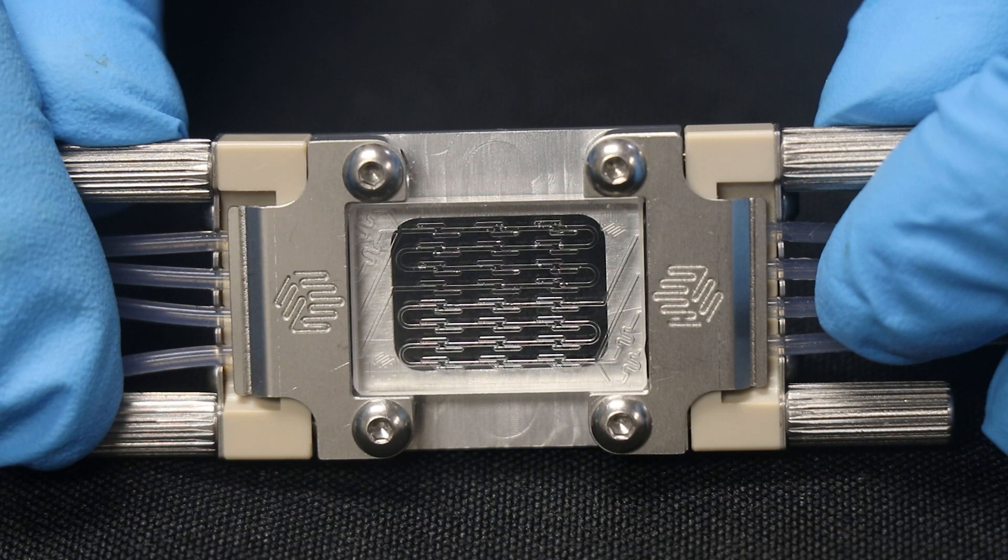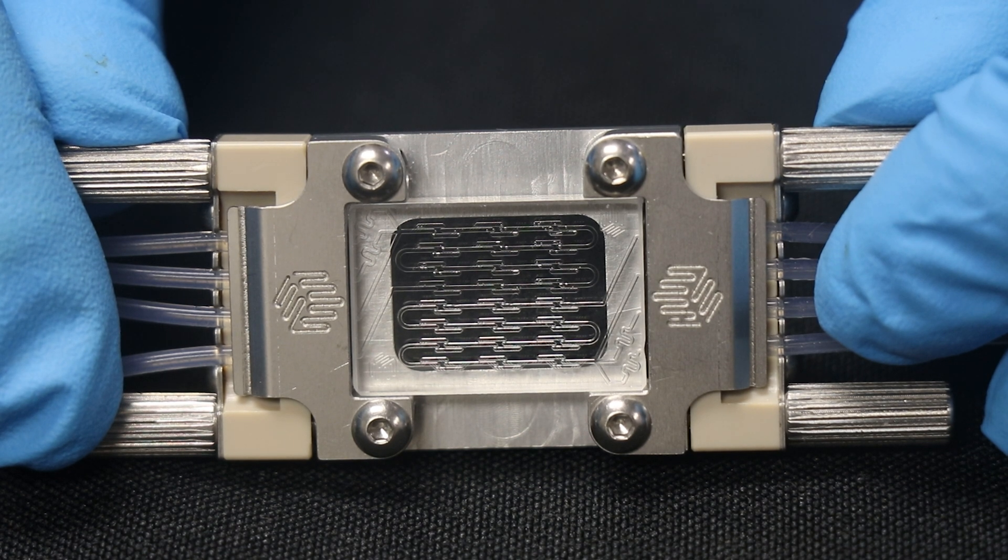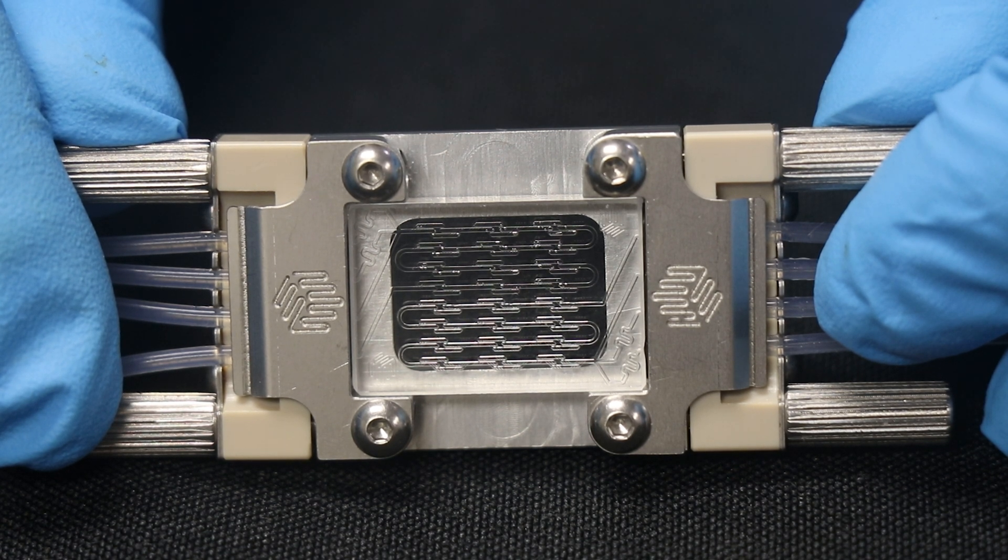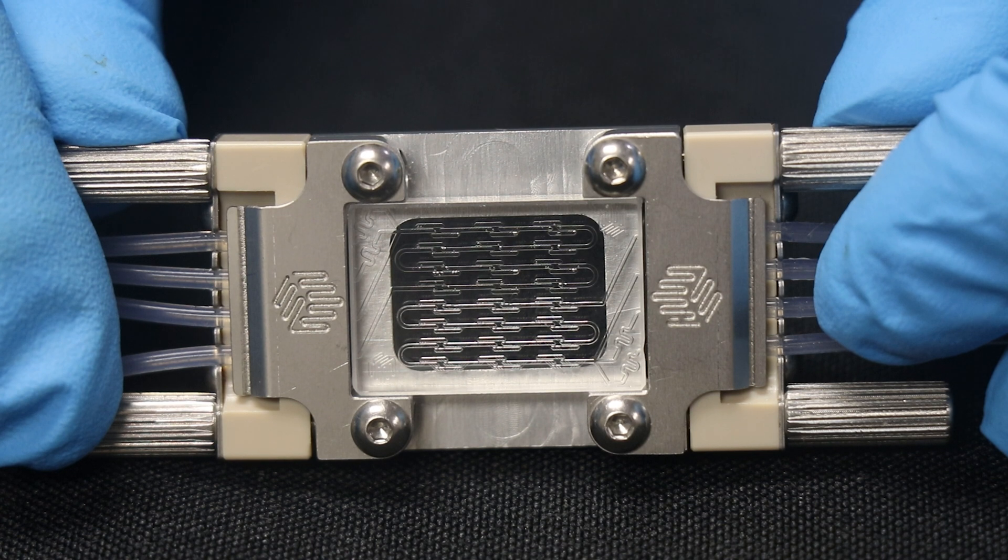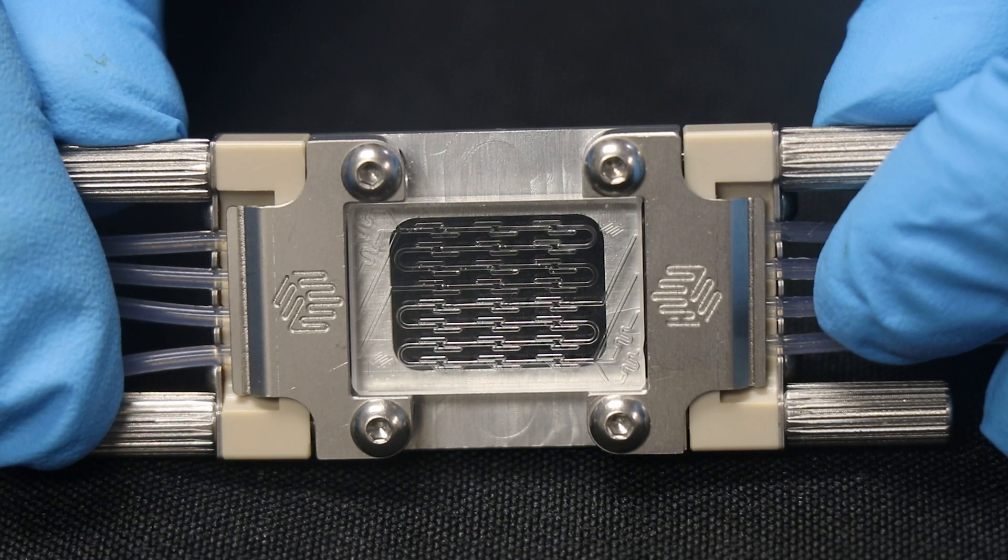Different chip architectures should be evaluated as a process parameter, especially if you are targeting different particle morphologies. Some chip architectures run best at slow flow rates, while others are better for higher flow rates.